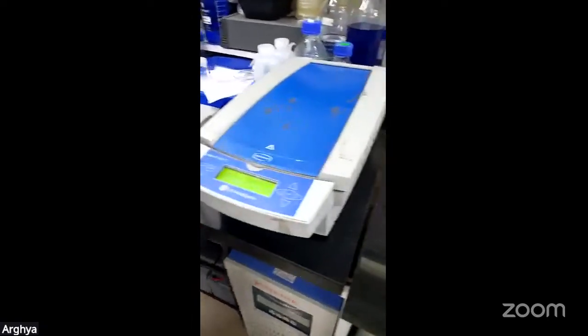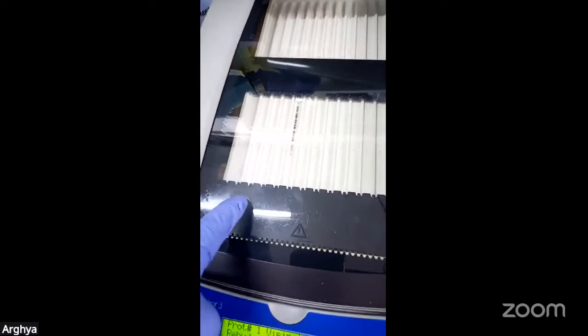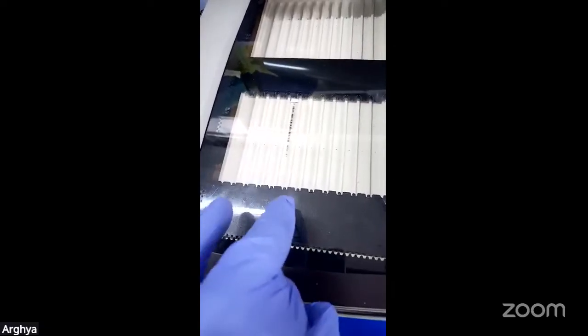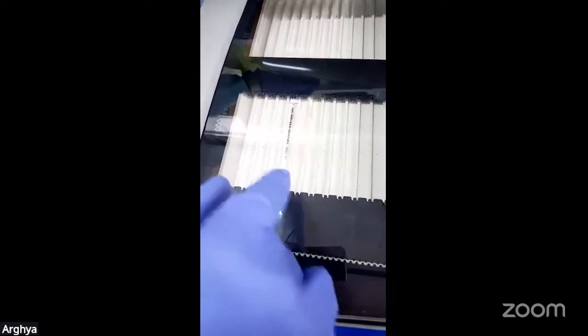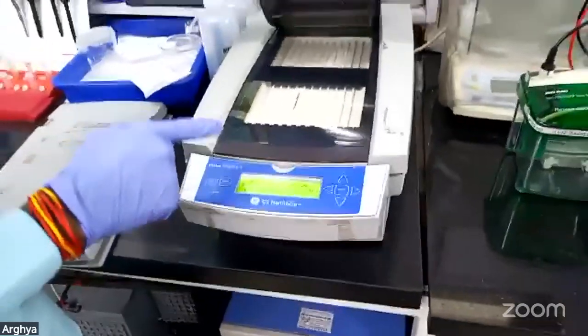Then we transfer our strip to the Ettan IPGphor tray for the isoelectric focusing. We fix the paper wick and electrode on the strip, and this step goes for 5 to 8 hours.